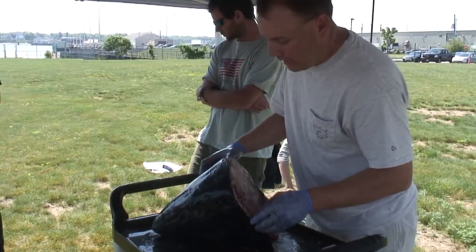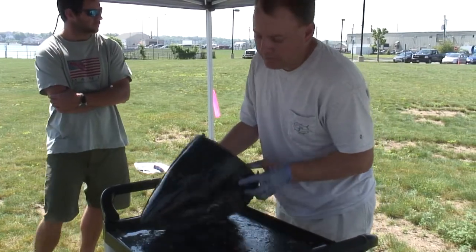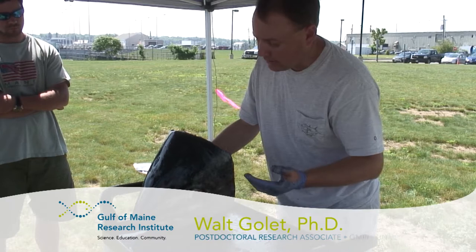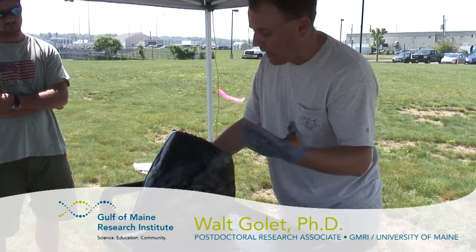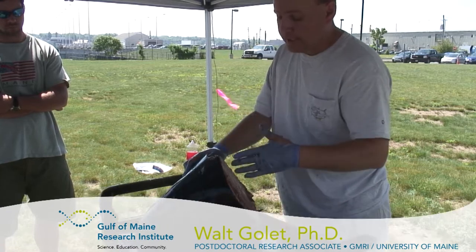What we're going to do today is demonstrate how to extract the otoliths out of, in this case, a bluefin tuna, but it applies for all tuna species. So if you want to take the otoliths out of blackfin, yellowfin, big eye, whatever it is, any tuna species, you can do so using this method.